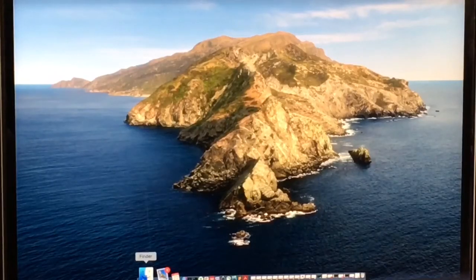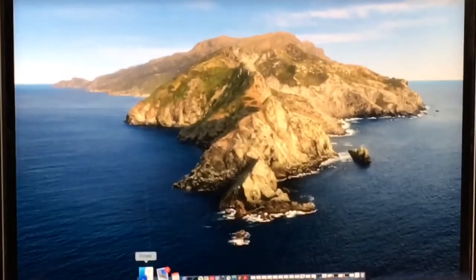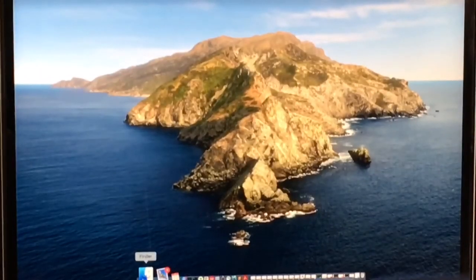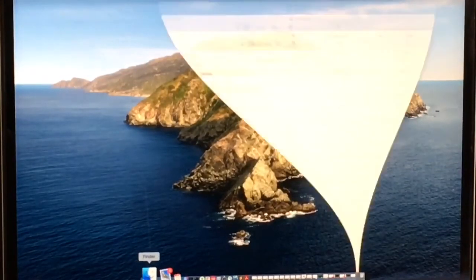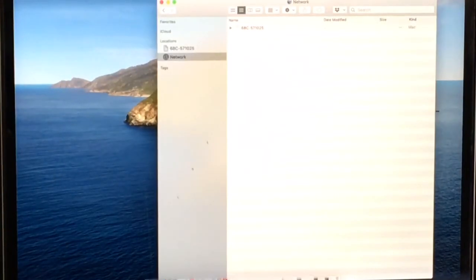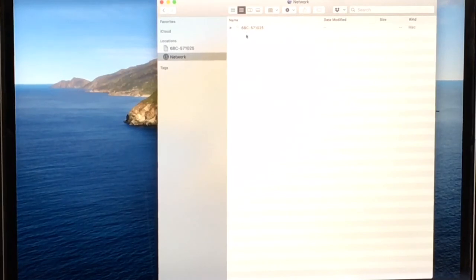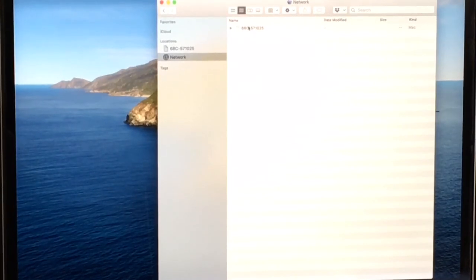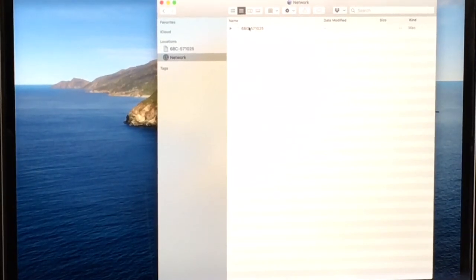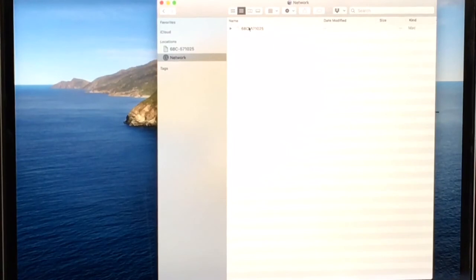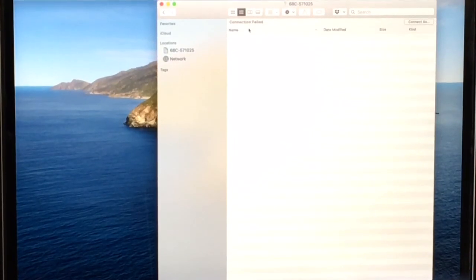For macOS users, go to Finder. Under Network, you should see the serial number of the console shows up in this window. Double-click this instrument, and then connect.